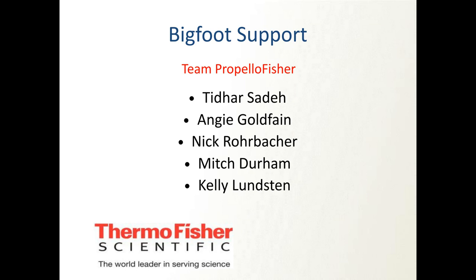Yes, I believe, I can't say yet, but I believe there are subtle differences that have to be looked at. I don't think one or the other makes or breaks an experiment. I think they can be used together, and as long as you're defining your autofluorescence with whatever cell type you're using, you're probably going to be okay. But once again, this is some of the bleeding edge stuff that we're trying to figure out now. I know Cytek's looking at that as well, and in some communications with Maria, she said that in certain areas of the spectrum, beads and cells can behave a little differently.